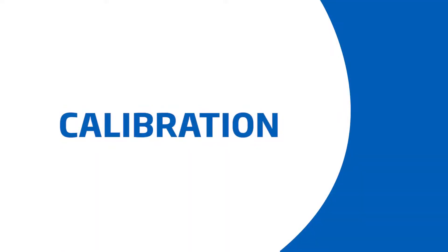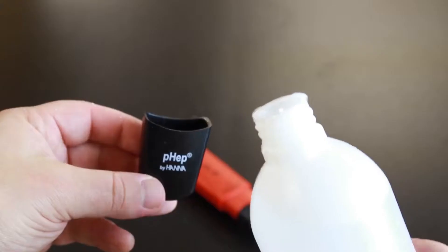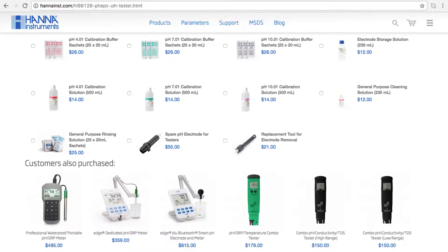Calibration is an important part of keeping your tester operating at its best. We recommend calibrating before each use. When you're not using your tester, we recommend you keep it in pH electrode storage solution, your HI-70300. If you don't have storage solution, pH 4 buffer works too. Without proper storage, the electrode gets dehydrated. We recommend you rinse and store your electrode after each use.